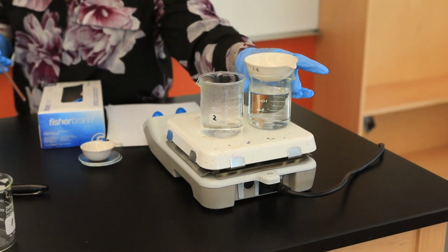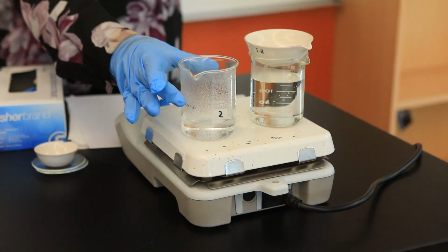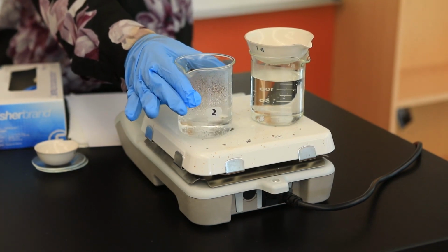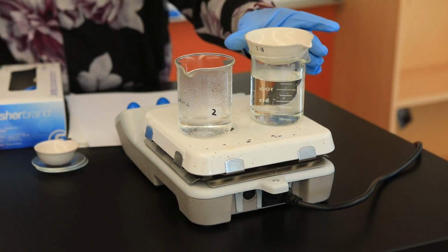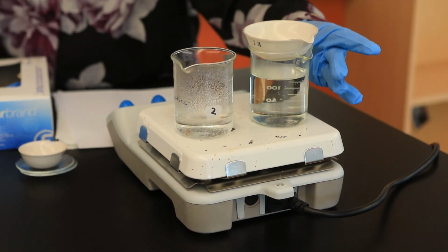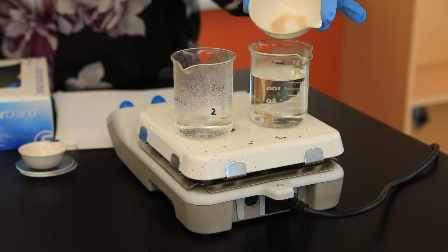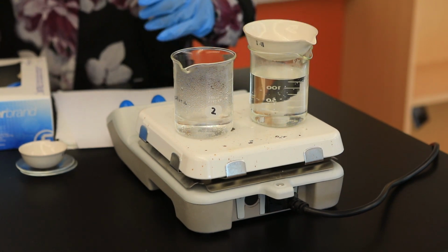So now, just as a reminder, don't forget that right now we have in my container number 2 my salt water solution. We're allowing this to evaporate to dryness. And now I have a setup that contains what? A beaker, just a beaker with water. But on top of that is my sand that I'm going to allow to sit to dry completely.